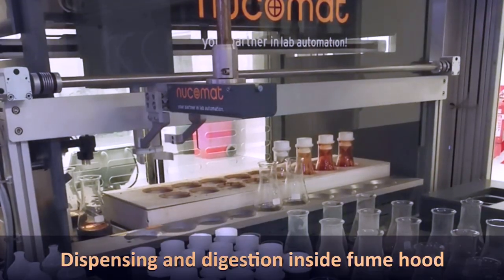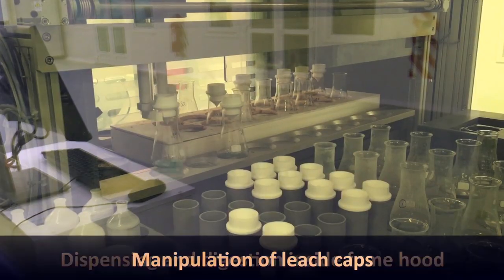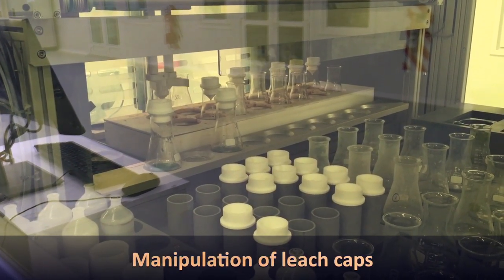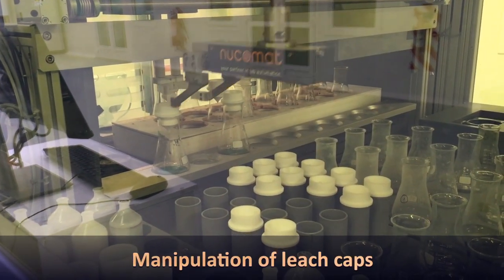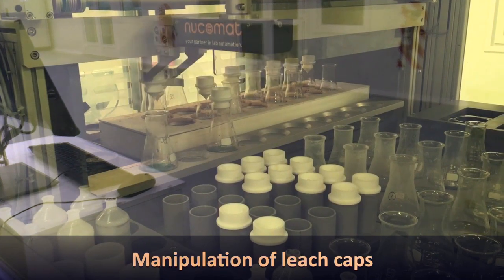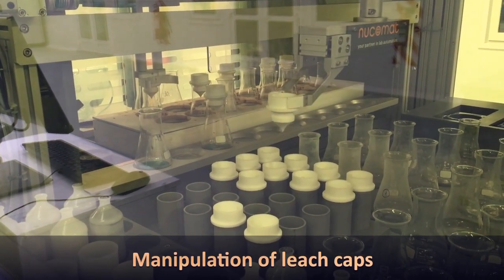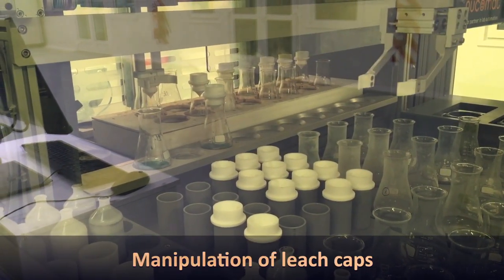All hazardous acid operations are performed inside an automated robotic fume hood, ensuring maximum safety for laboratory staff and minimizing exposure to potential health risks. During digestion, leach caps are used to reduce acid evaporation. Once this stage is complete, the caps are removed to allow further concentration of the sample under controlled heating conditions.